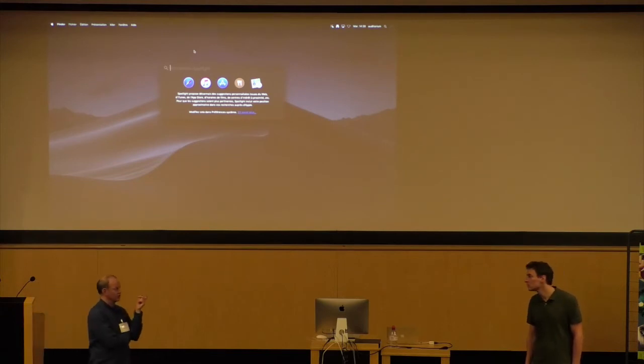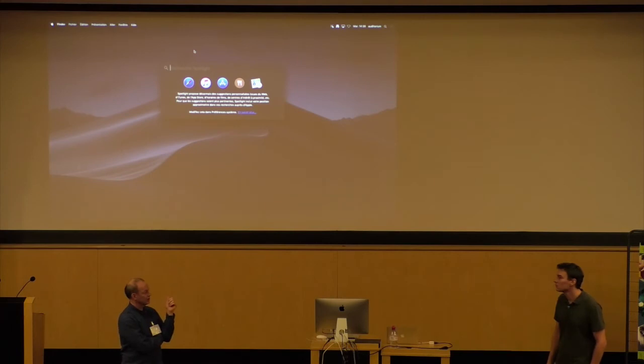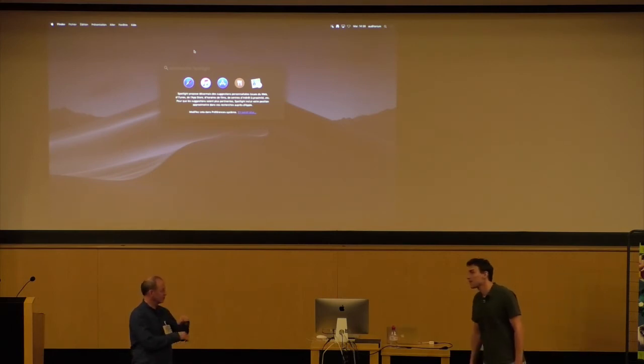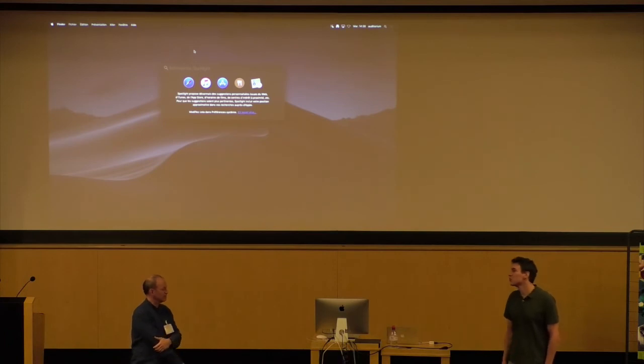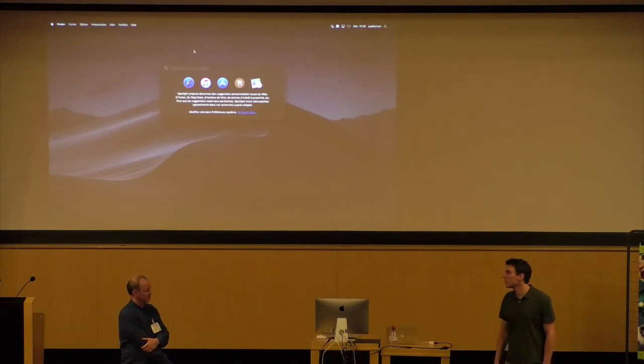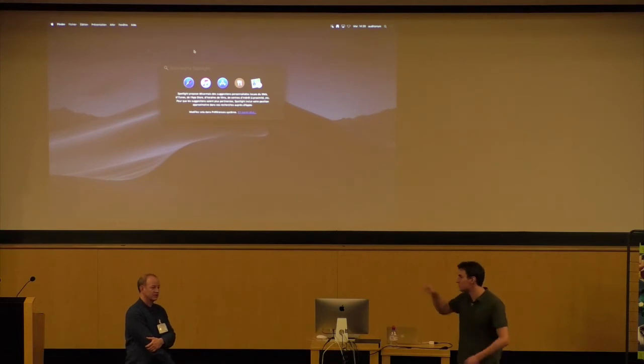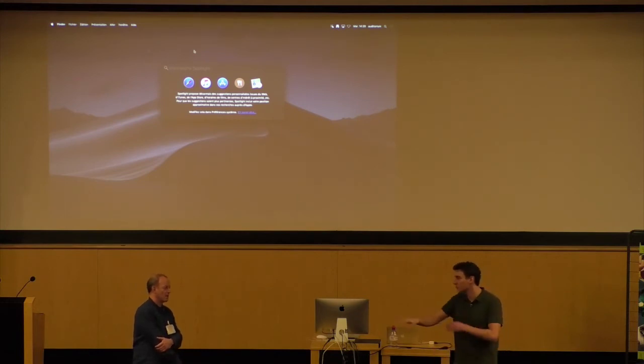And so what is happening exactly during the thinning step? Because you showed a beam coming, but this is not thinning itself. No, this is just for monitoring. So what you do first, you do a blank with the empty grid, and then you know what is completely dry. Then you can measure the intensity is much lower if you apply the droplet. Then after withdrawing, with this little bit of evaporation, you can see the intensity is coming back, and then you can set the threshold when it should be plunge frozen. It tells you immediately whether the grid is good or not, which is also quite interesting.